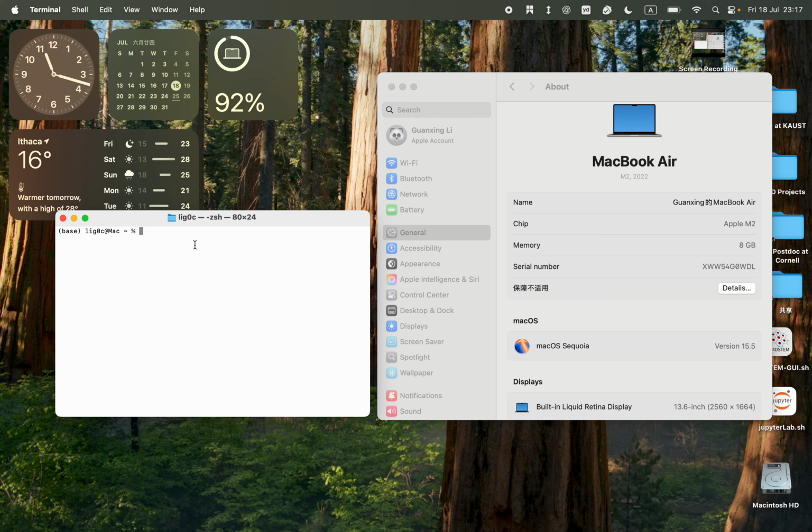If you are using pip to install your package, just to check your pip version. In this case, I'm gonna do conda list pip, and you'll see that I'm using a fairly modern pip version, which is 24. If you find out your pip version is kind of old, that may be resolving to incorrect packages. So we will suggest you to update your pip.